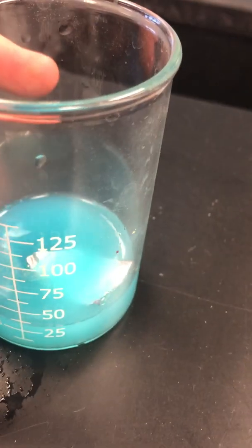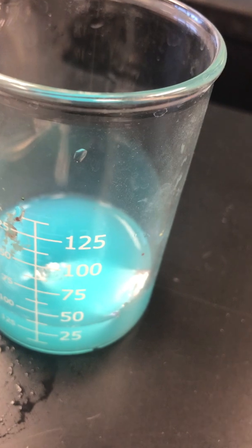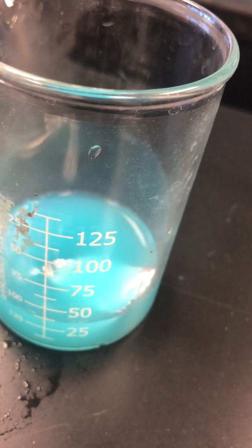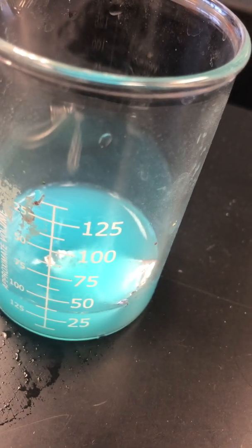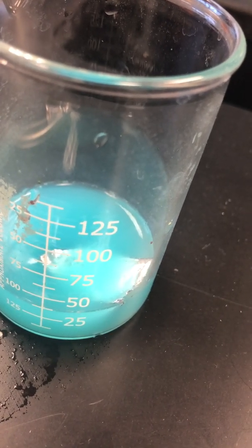Here, I'm going to help it out a little bit. It's floating on top of the liquid, and I need it to actually submerge a little bit. There we go. So I recognize the lighting's not terribly great and there's a lot of glare, but what do you notice is starting to happen to the edges of the aluminum foil? It's starting to do what exactly?